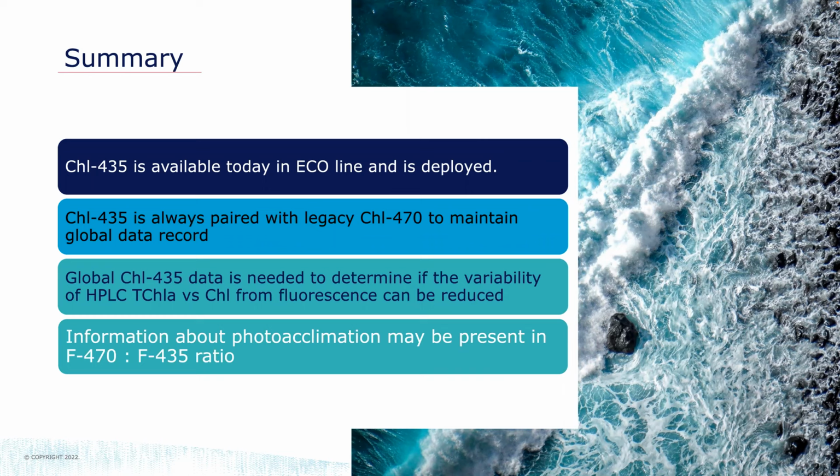I really do want to dissipate that light as heat. And in fact, what we can see is on a daily basis, even if I hold the phytoplankton constant, the fluorescence goes down in the middle of the day because there are different accessory pigments being added and they actually take more of the photons away. And that's a problem, actually. And we deal with that in Argo floats by making adjustments to the daytime fluorescence so that what's called non-photochemical quenching is adjusted for. But the point is that that's a little bit about photoadaptation. On the plus side, we can add pigments to increase our ability to funnel photons to the reaction center, the chlorophyll molecule. We can also do photoprotective accessory pigments, which essentially keep photons away from those. And those are the different aspects. That's the short version of photoadaptation.